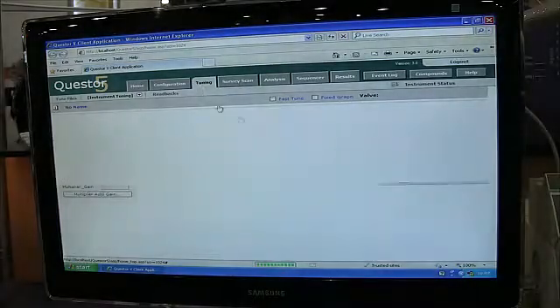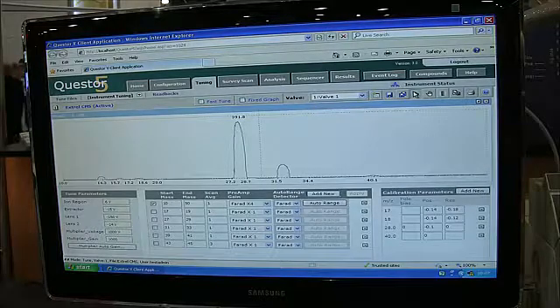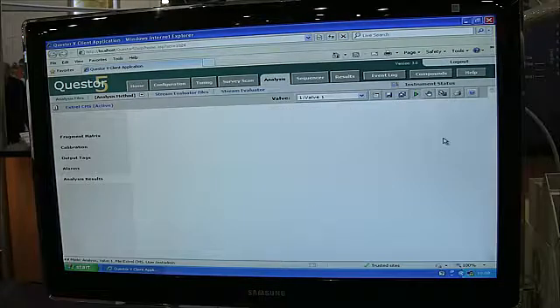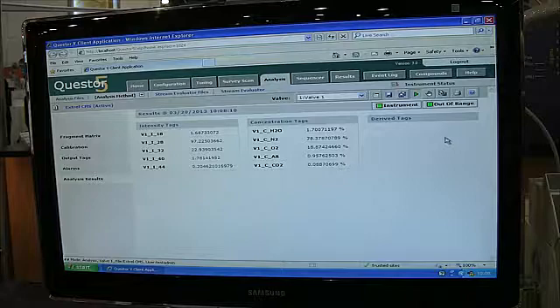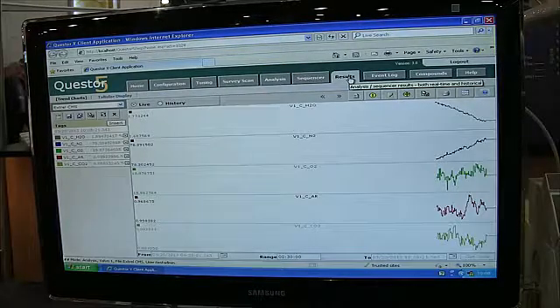The Questa 5 control software is powerful and intuitive. Scan the entire mass range in seconds to identify unknowns, or with the click of a mouse switch modes to perform quantitative analysis using a set of ions you have selected. This high precision quantitation is delivered at less than 400ms per component.